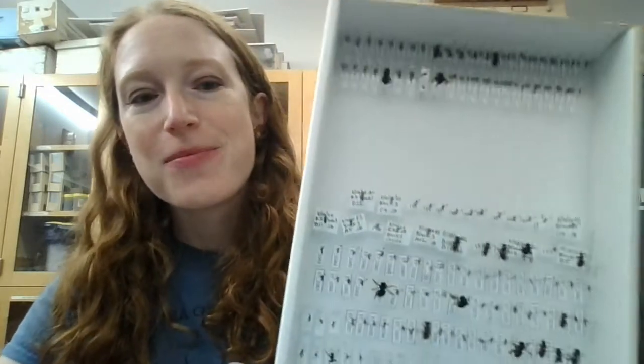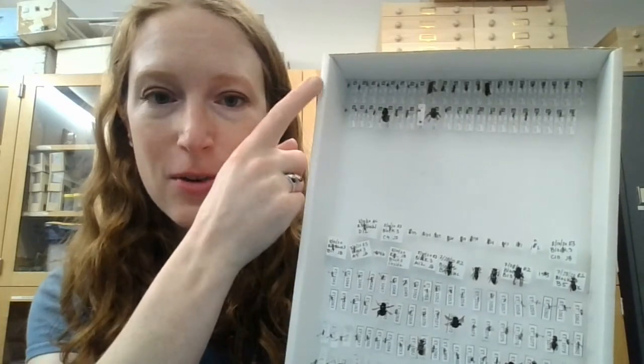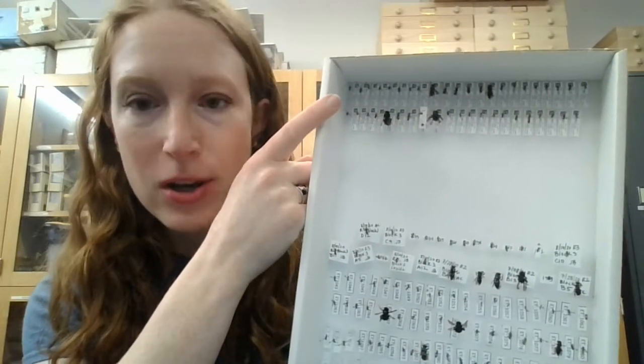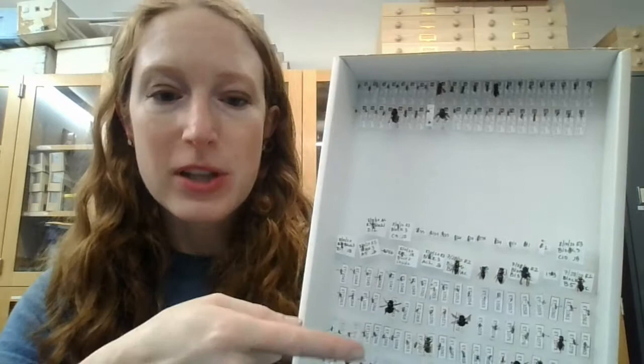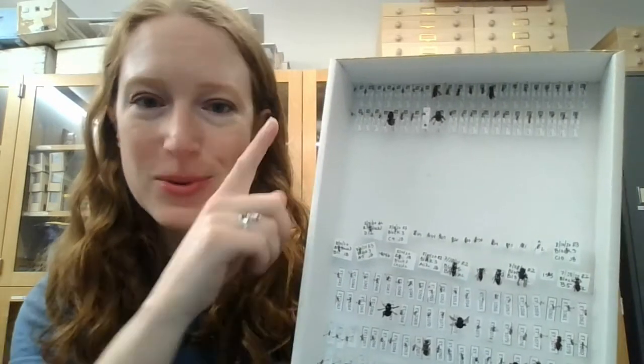So this is the stage that I'm on in all of that: I've printed out these formal permanent barcode labels, and I'm just replacing the messy processing labels with these formal barcode labels. It's a tedious, time-consuming task, but it's nice to be able to do it for a week as a break from some of the more difficult work that I do. And I get to catch up on BookTube a little bit and listen to some audiobooks while I do it.